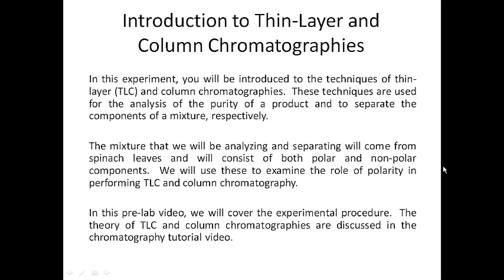Okay, this is the pre-lab lecture video for experiment 6, which is going to deal with chromatography. In this experiment, we're going to use thin layer chromatography and have an introduction to column chromatography. We're going to do these two techniques after we isolate some pigments from spinach leaves. And the pigments that we're going to get consist of both polar and non-polar components.